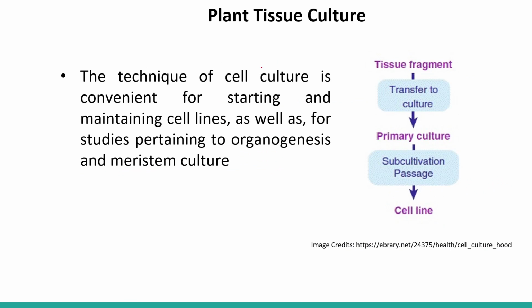The technique of cell culture is convenient for starting and maintaining cell lines, as well as for studies pertaining to organogenesis and meristem culture. So the tissue fragment is taken out and transferred to the culture. That tissue is transferred to the culture. This is called the primary culture.